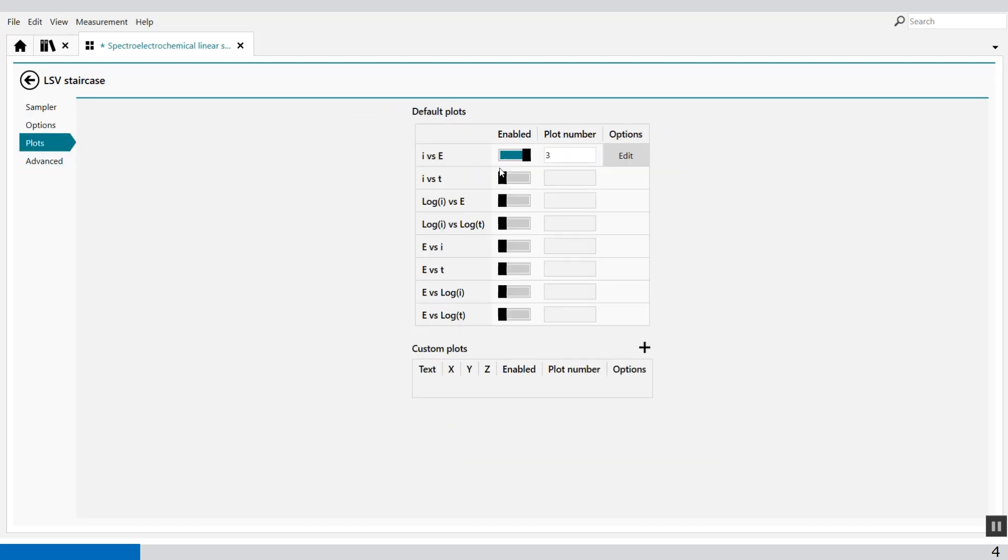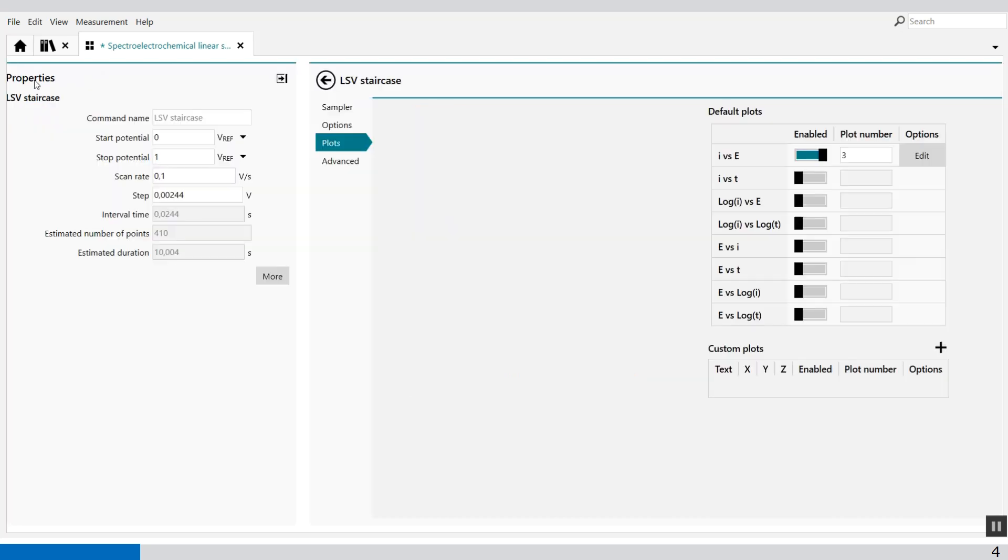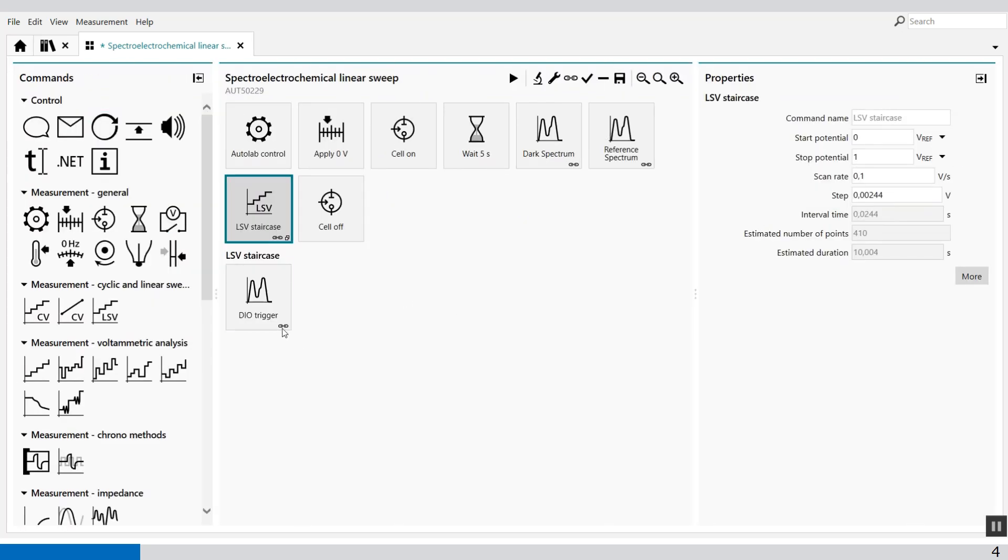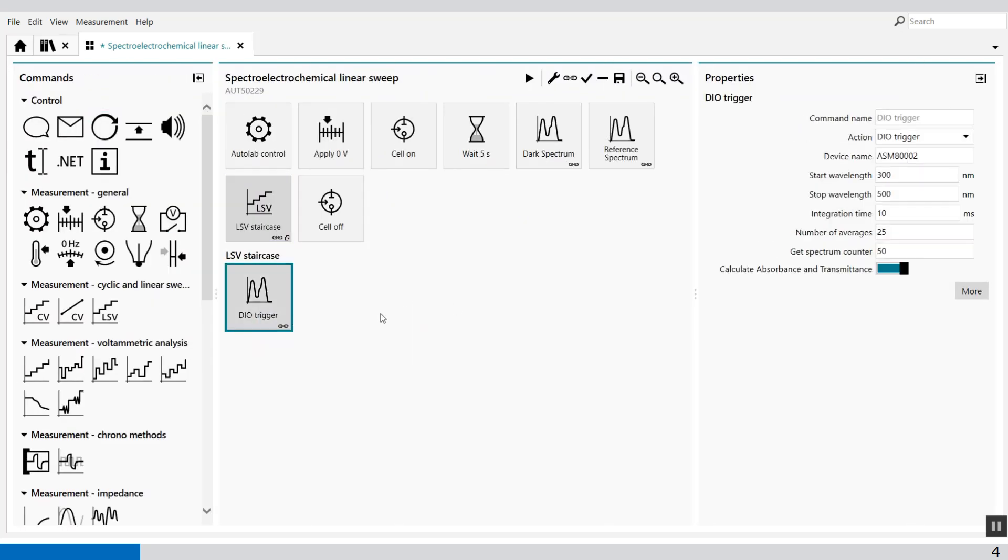In the plot, the I versus E, the voltammogram, we plot in plot number 3. And the DO trigger, when the trigger is sent to the spectrophotometer to get a spectrum, is after each 50 data points.